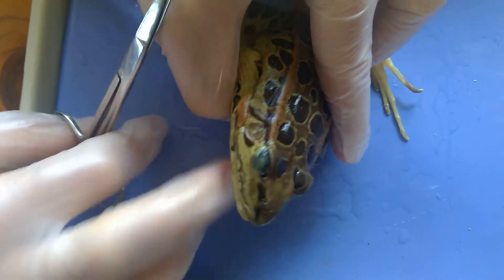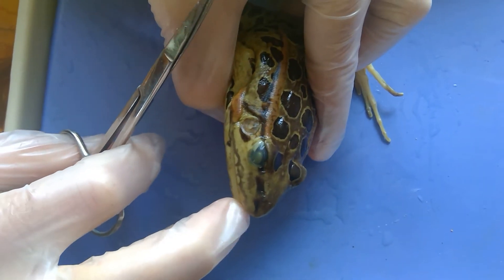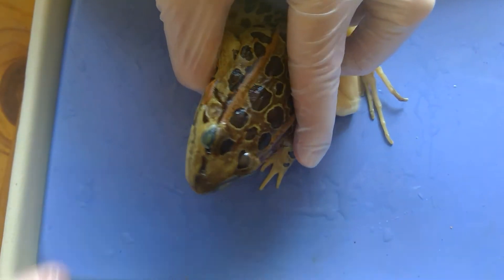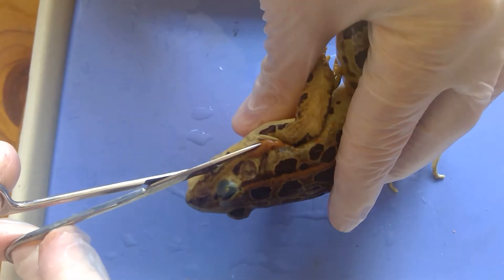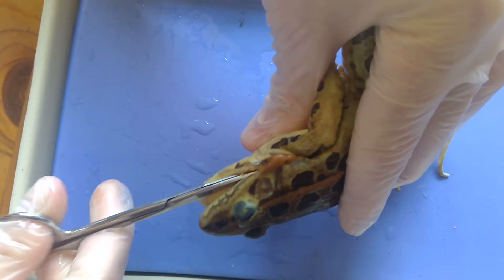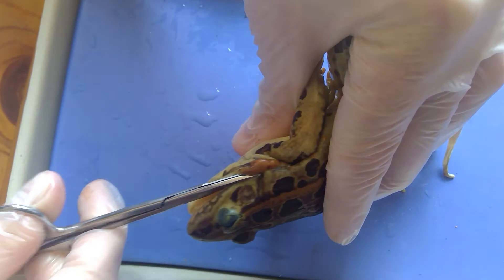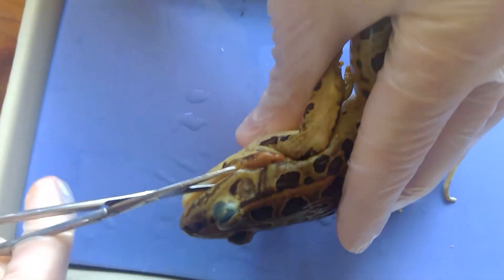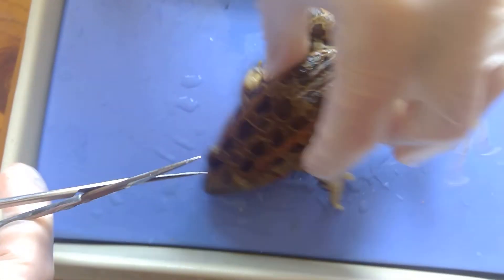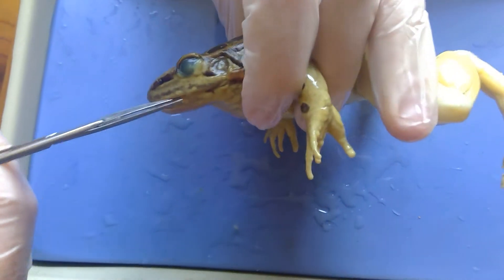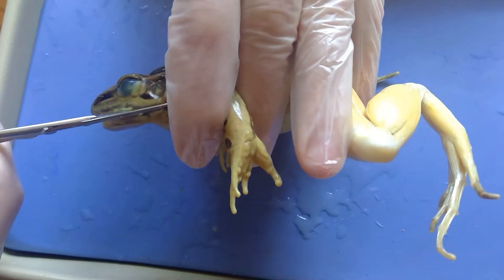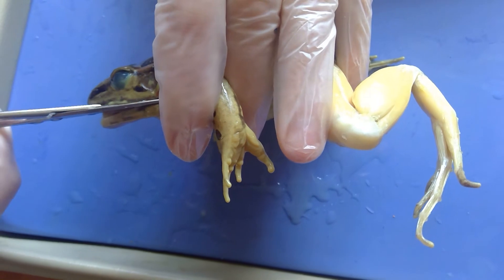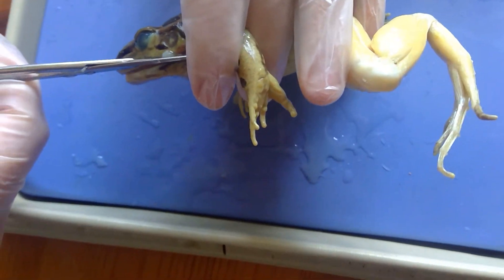And the frog's mouth is pretty tightly shut. So I'm going to cut through the muscle here in its jaw just so that I can more easily open up the mouth. So I'm cutting it to beyond the tympanum.